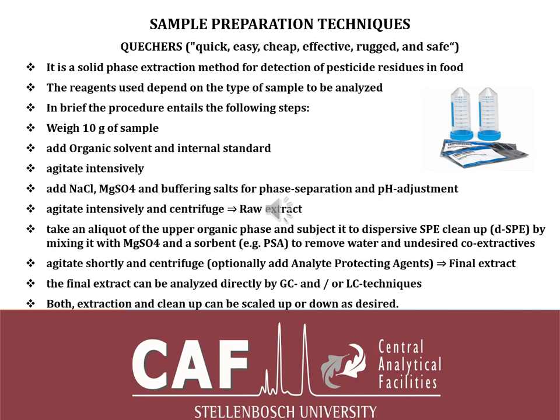But also, just as a brief example, exactly when we were analyzing for acrylamide in potato chips, we weighed the potato chips and then we added water and then we added acetonitrile, and then we found that we were having a lot of interferences because of the fat that was in the potato chip. So we introduced hexane, because then the hexane will trap all the fat, and then the acrylamide will go into the acetonitrile.